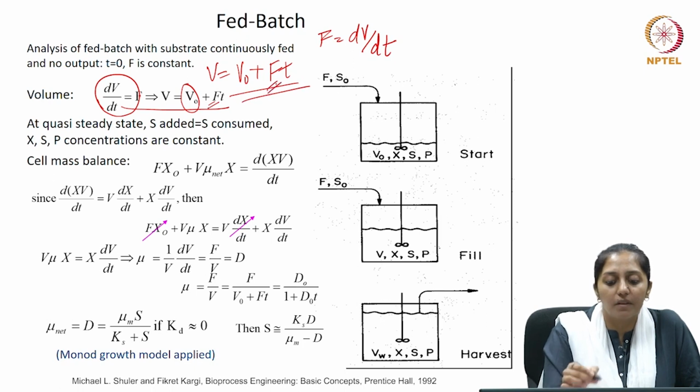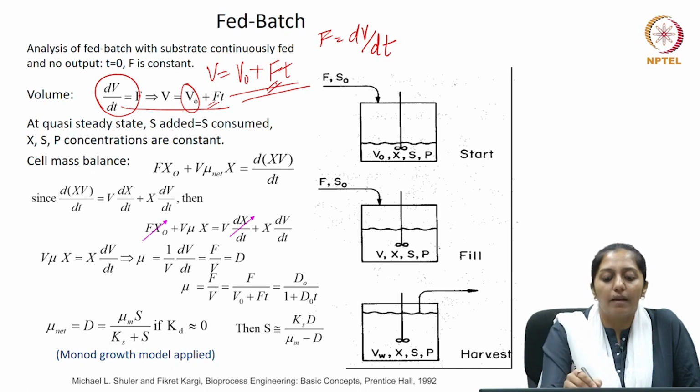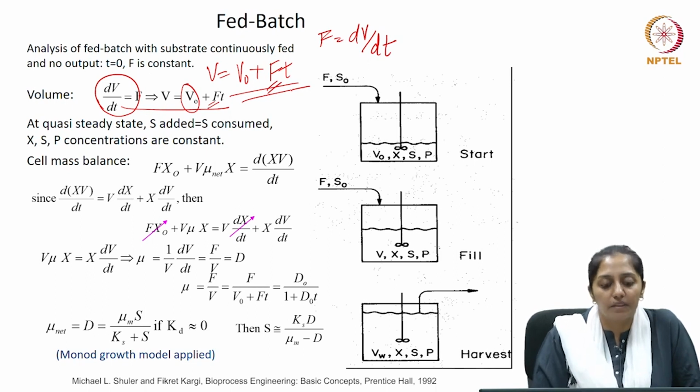Now, this F here is a constant, because it is a constant feed flow rate system. So, the volume will keep increasing with time.